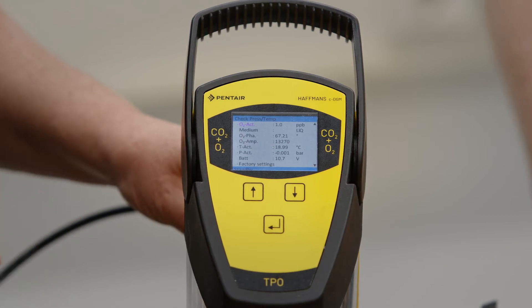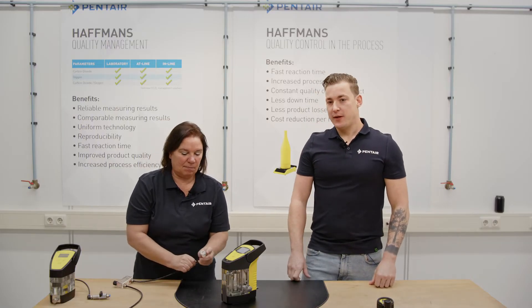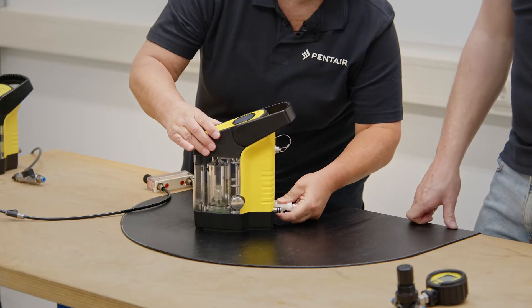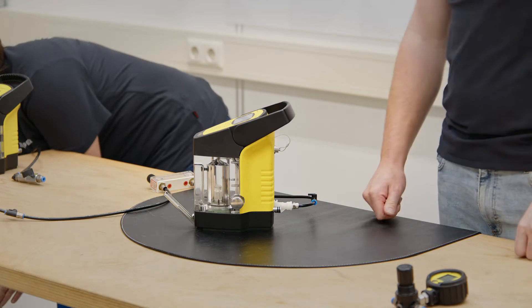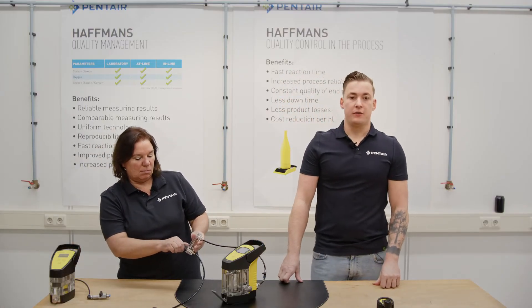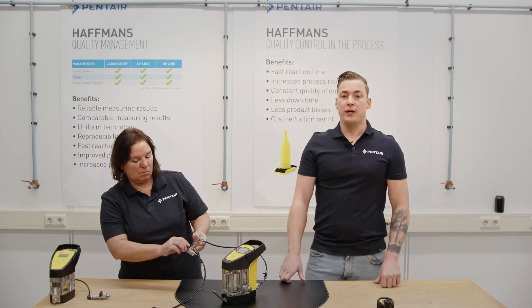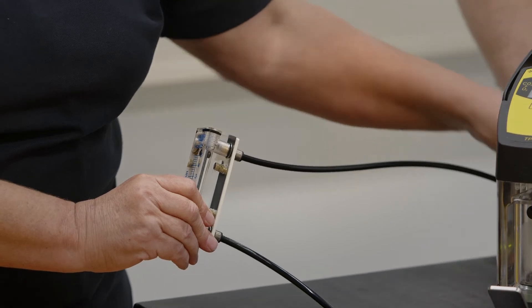First let's start to check the zero point. For checking the O2, flush it with zero gas and check if the O2 value does react and goes down below 5 ppb. Check if the phase is higher than 65 and the amplitude is higher than 5000. When phase and amplitude are okay but the ppb does not go below 5, then try if this can be fixed with a correct new calibration.